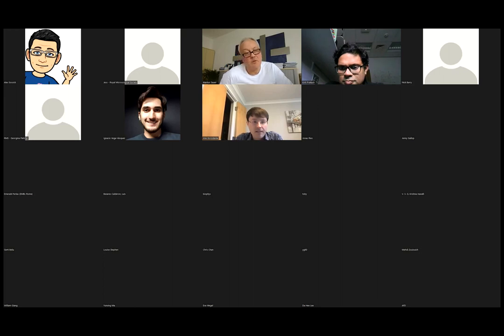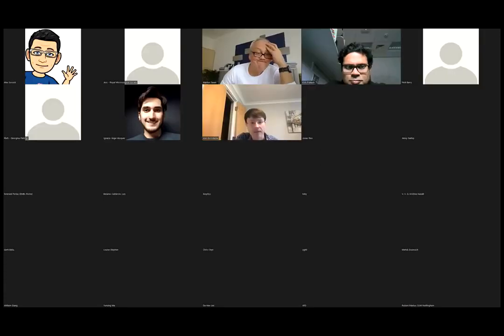Eva always has a hard time optimizing the fixation conditions for all these samples. Yeah, I guess that'll probably be my guess as well, because we also know they're so sensitive and delicate. Exactly. But my hope is now with cryofixation. Yeah, that'll be the way to go, I guess. Yeah, absolutely. Thank you.